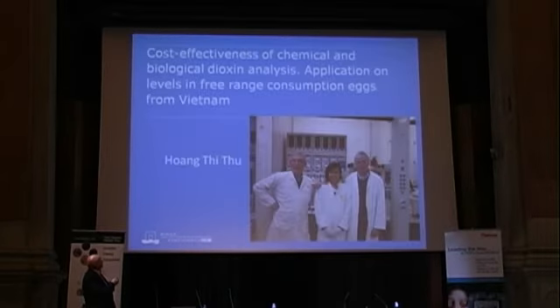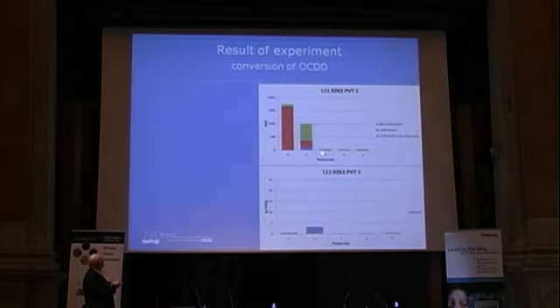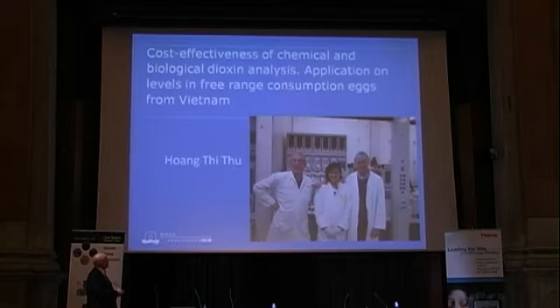Okay, the next one: for the last 6 months in our laboratory there was a colleague from Vietnam working too. She is standing before the PowerPrep machine with two of my colleagues, and she was working on two subjects. She did some analysis on eggs which were obtained in Vietnam, and that was her main topic, she studied the economic aspects of a method for analysis. I'll show you some results.